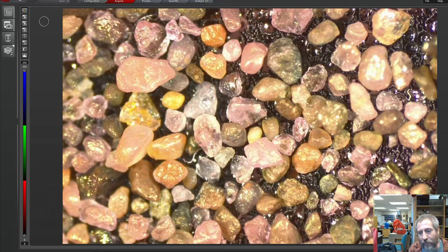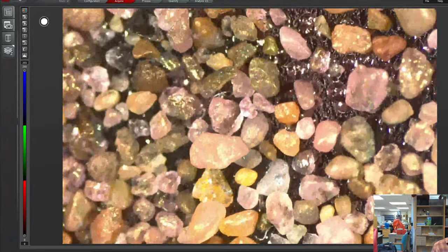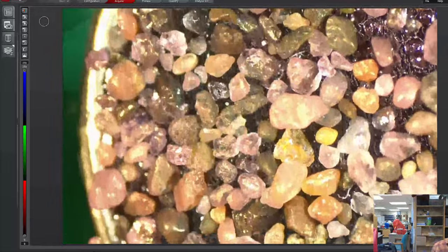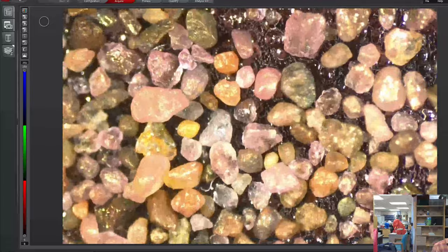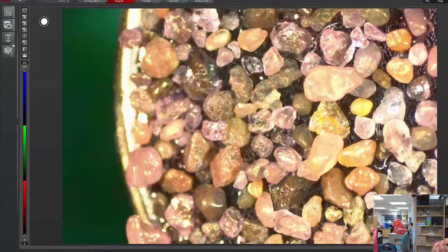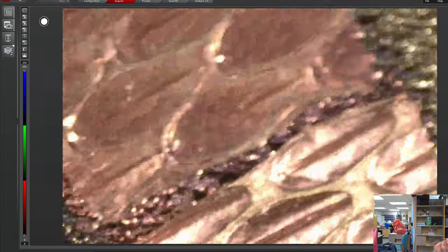But even with the gold plating, you can tell it's quartz in some of the cases, and some of the minerals are visible. I thought I saw some sort of mica. Not the mica that was in the chat. And I think I always see some pieces of chlorite whenever Pacific Plankton shows her minerals, and they're not gold coated. And I think we also saw some magnetite in this SEM image, but I don't remember which one of these is the magnetite. Because it's dark and opaque, it probably is the stuff that looks like nuggets of gold in there. And then we looked at some snake skin.